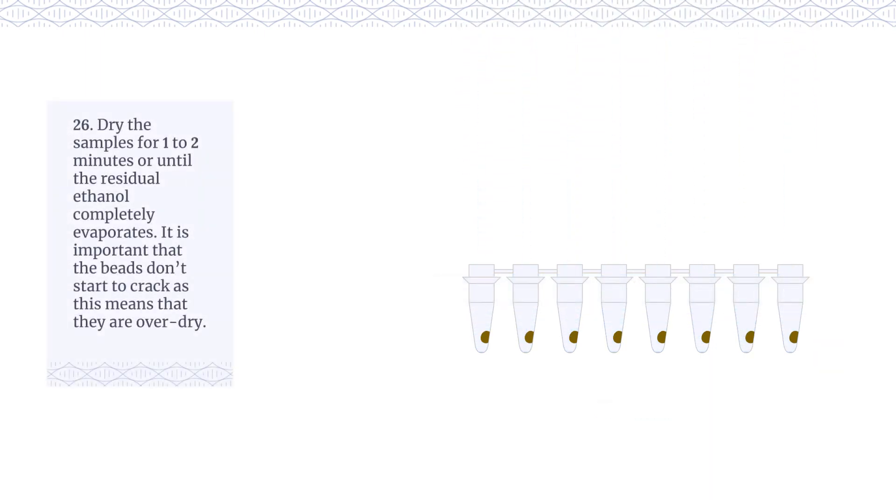Dry the samples for 1-2 minutes or until the residual ethanol completely evaporates. It is important that the beads don't start to crack as this means that they are over dry.